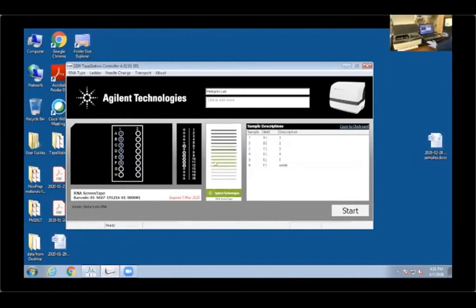The second part, it's these lanes that turn basically from light gray into light green. Those are the lanes that we are gonna use. You might notice that you have one green lane, one gray lane, and one green lane again. This is only a formatting problem. Well, it's not a problem, it's a different format that the TapeStation is using.